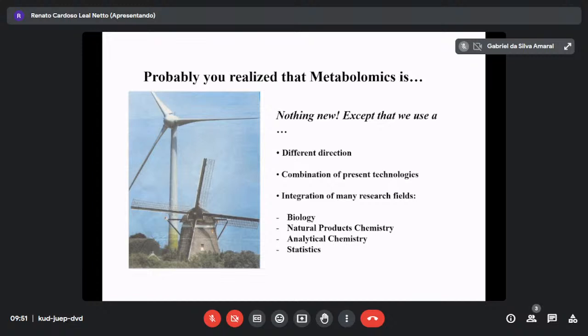Of course, depending on different ions, fragmentation is completely different, but EI fragmentation includes everything. If the EI spectrum is 100, ESI shows some part of EI, and Orbitrap some part of this data. And also, now you can do simulation of the fragmentation, like Excalibur, long time ago, those kinds of things based on EI.